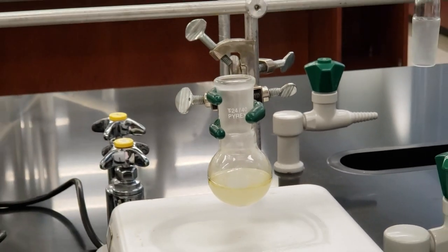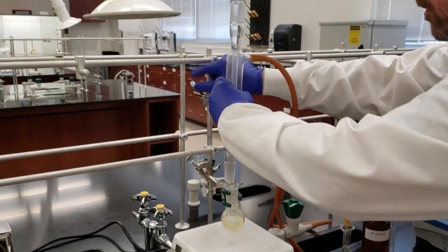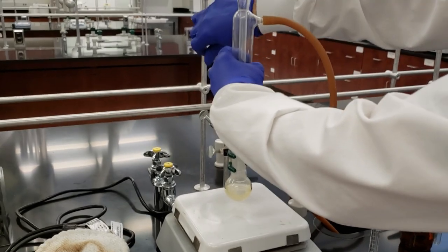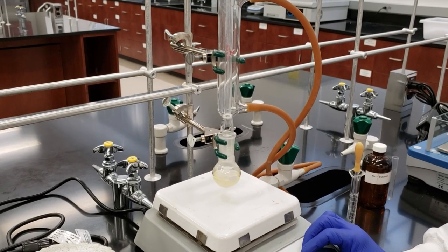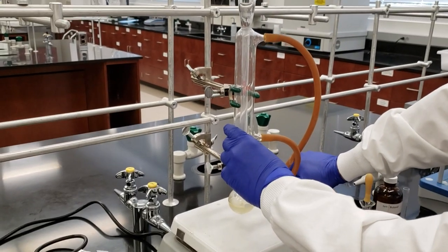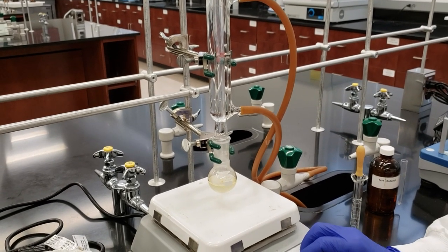And we finished the addition of our tert-butyl alcohol. I'm going to go ahead and place a cold water condenser on top. And we're going to let it stir for about 5 minutes. Like that. Make sure your condenser is seated properly. We'll go ahead and fill our condenser, inlet and outlet, as always. We'll let this stir for 5 minutes and we'll come back and check on it.